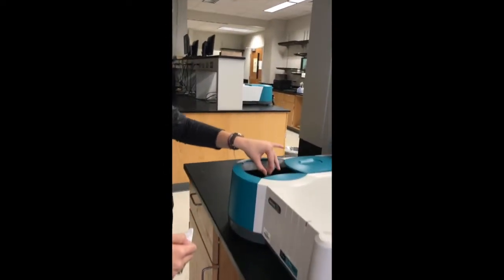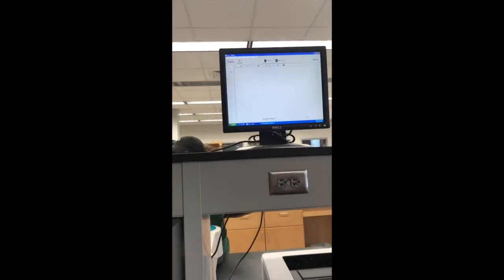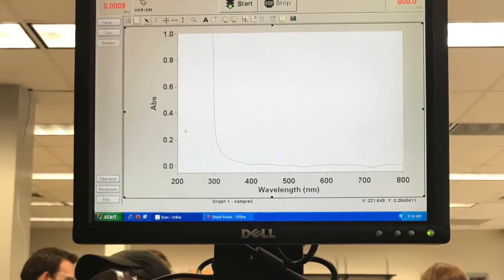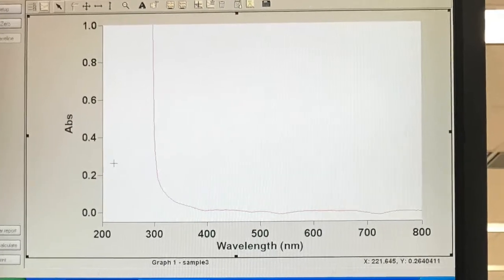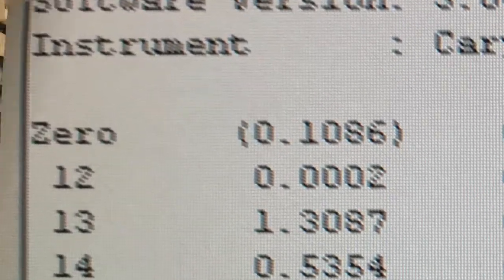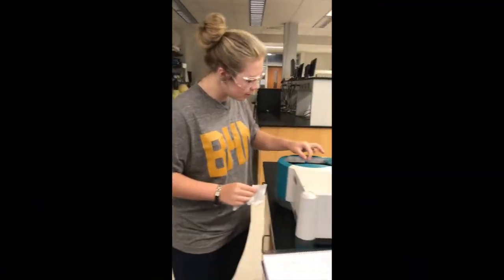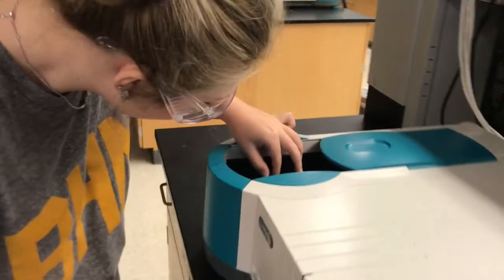The first thing you should do when there is place your blank into the spectrophotometer after you wipe the 2 sides. Then use the programs on the computer to zero these programs to make sure that the absorbances you record for each concentrated solution are accurate. When you are sure the programs are zeroed, remove the blank from the spectrophotometer. After the program is zeroed, begin testing your solutions.